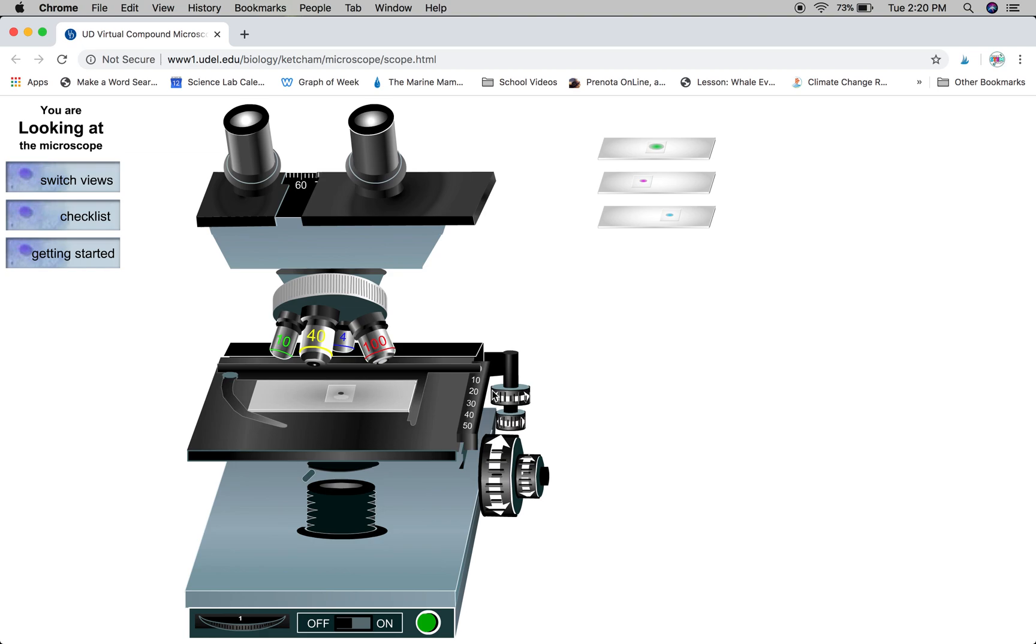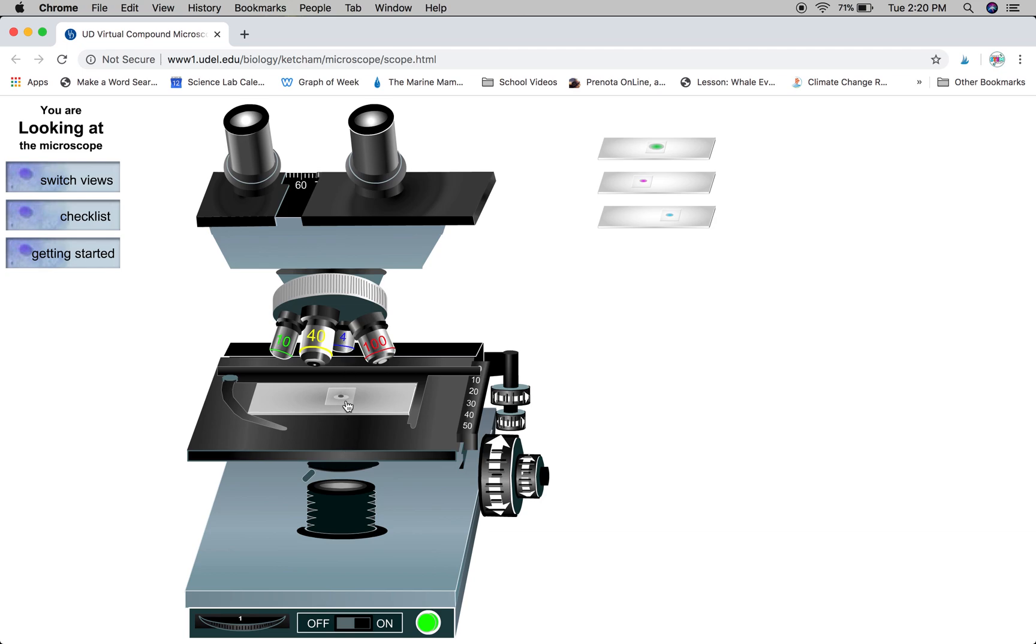Once it's in place, then you can turn on the power and you want to make sure that your lowest power objective lens, the one in the back which is the four times magnification, is in place.